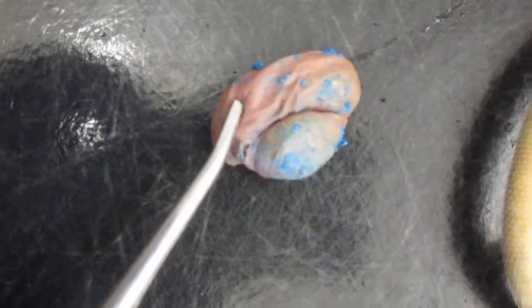This is the placenta right here. This is the placenta. This right here is a fetus covered by the amniotic sac. Placenta, fetus covered by amniotic sac right here where the probe is. And then right here we can see the fetus here.